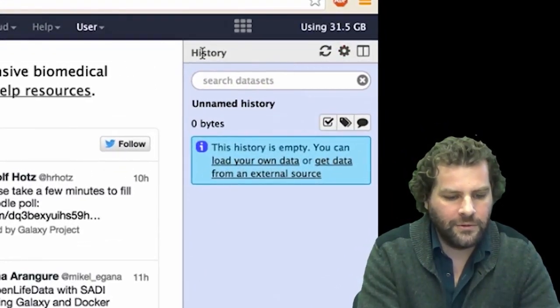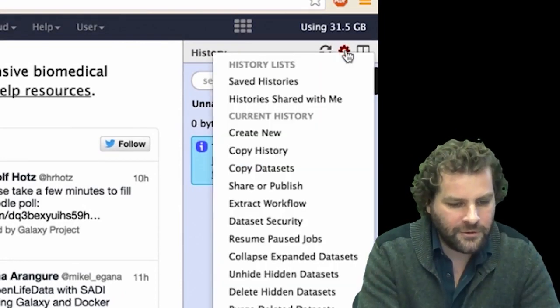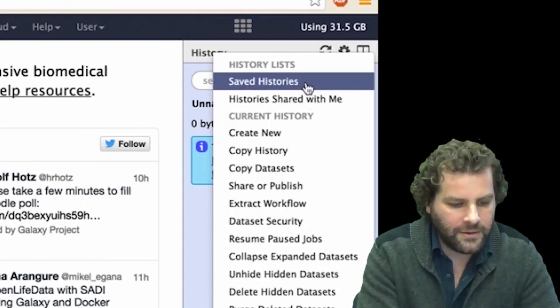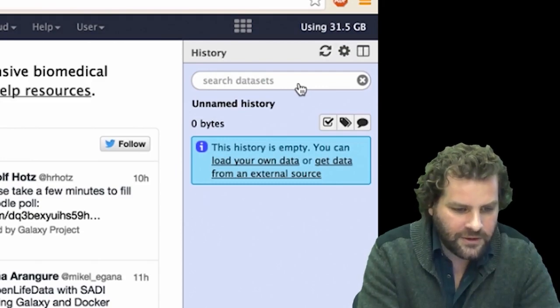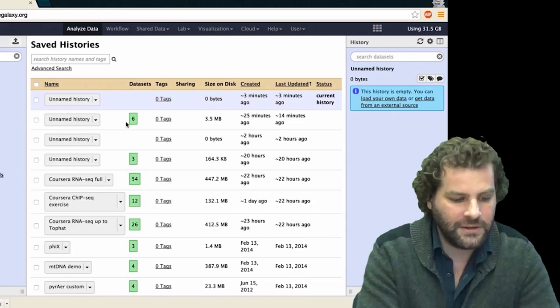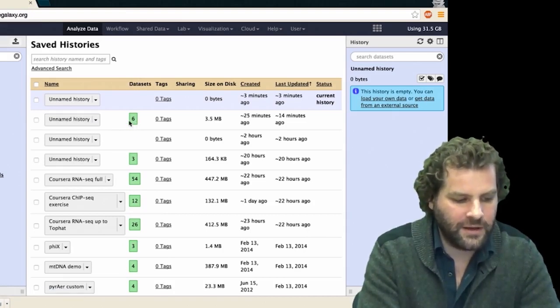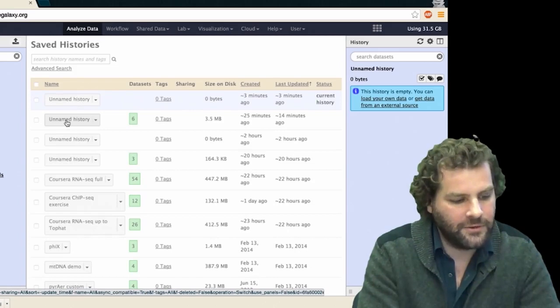So what we can do is go to history options again and go to saved histories. This is only available as a logged in user, and you can see all of my previous histories in this case. You should have a previous history that has the results of the analysis that we did in the last lecture.